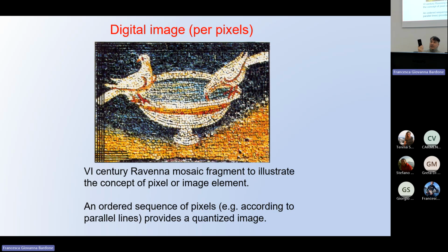It's a silicon-based electronic pixel. Very, very small, you cannot see. You need a microscope to see the pixel, but it's made in the same system. And the image is built in the same way. But it's so fast that you cannot see. It seems a stationary image. But if you have a specific electronic device, oscilloscopes, you can see that even very, very fast, it's built in the same way. Start from one point, creates a line, another line, to have a frame.